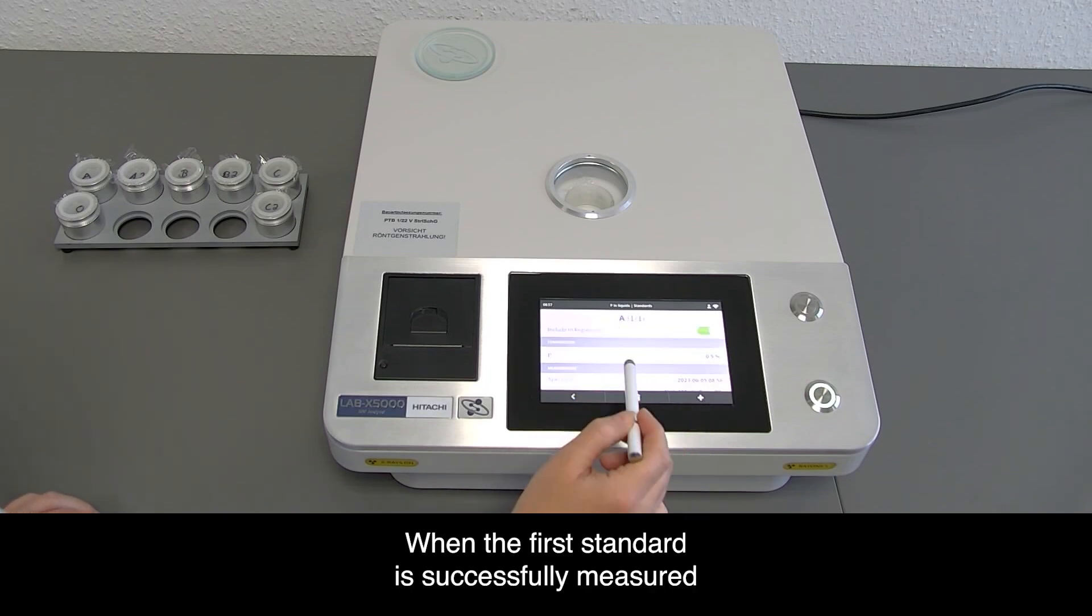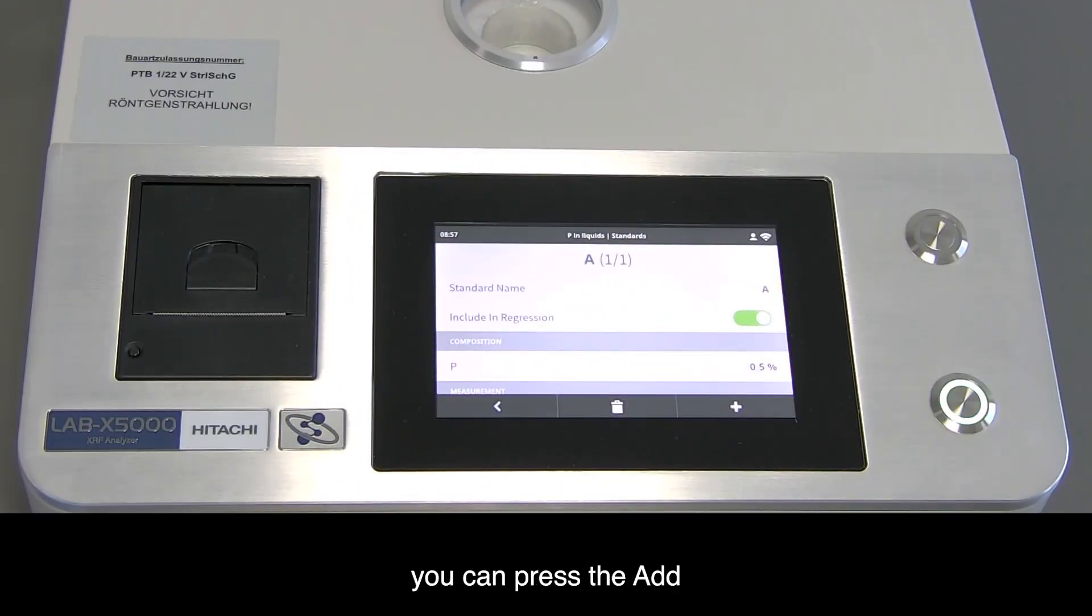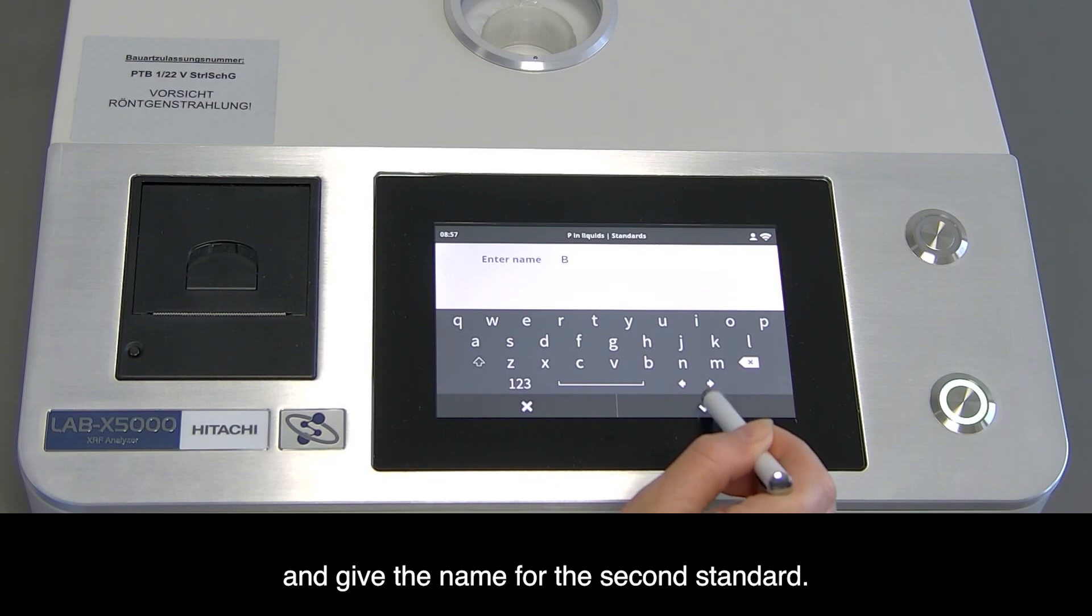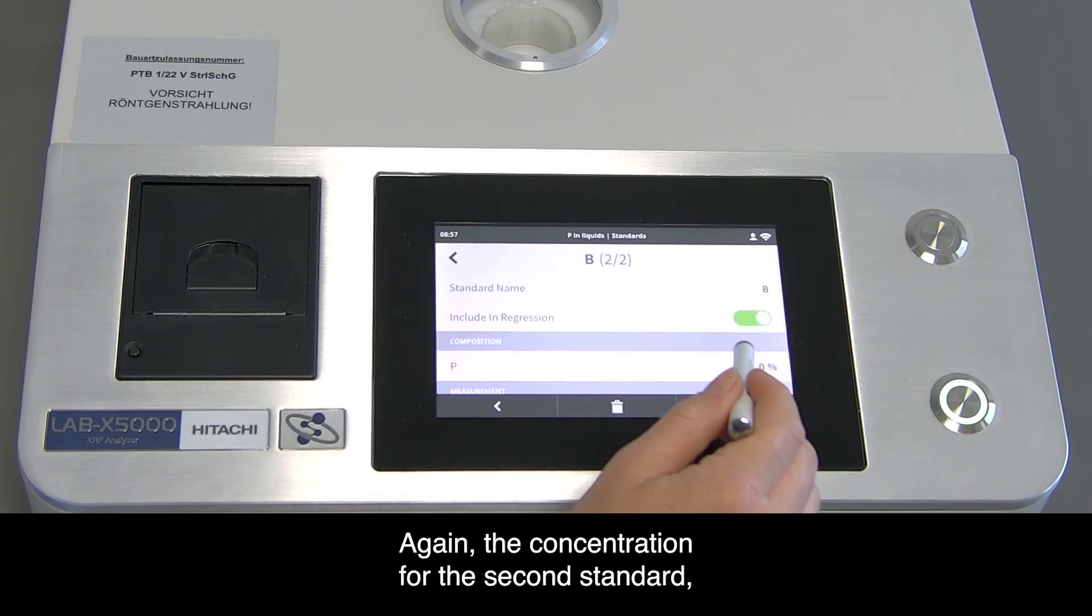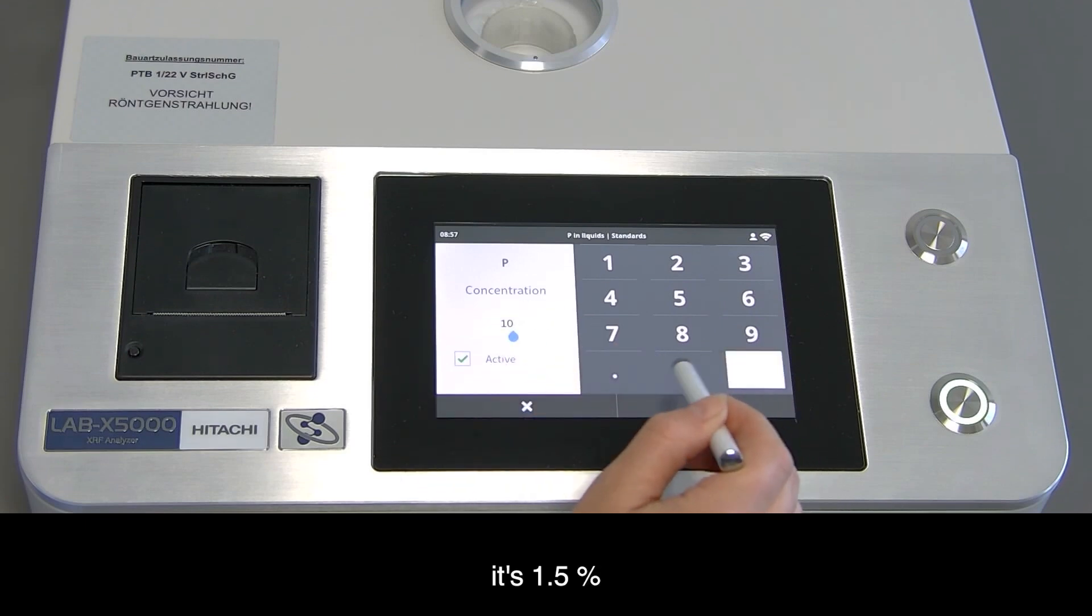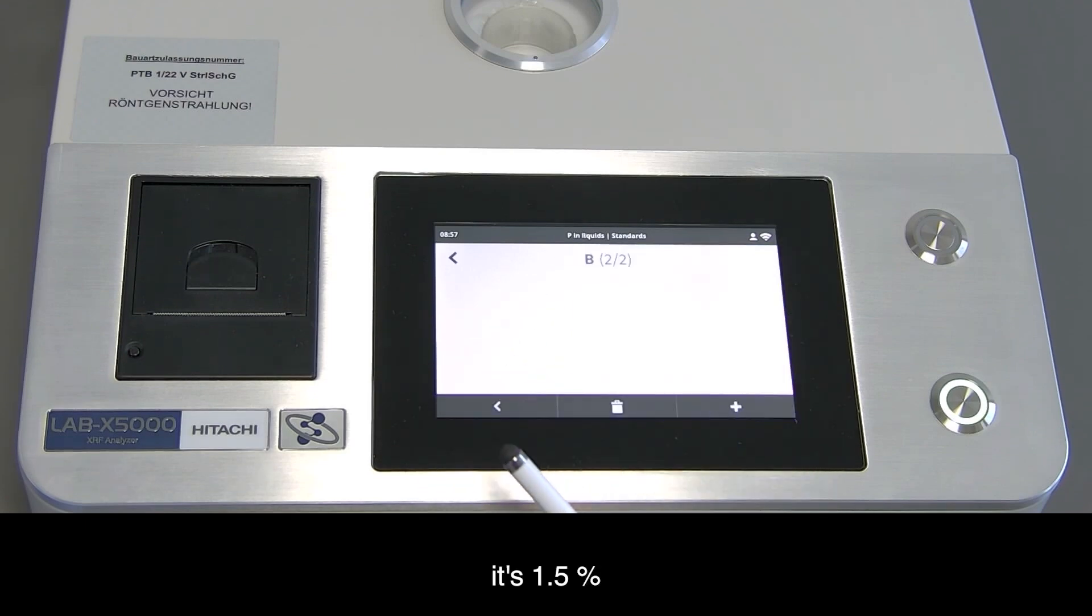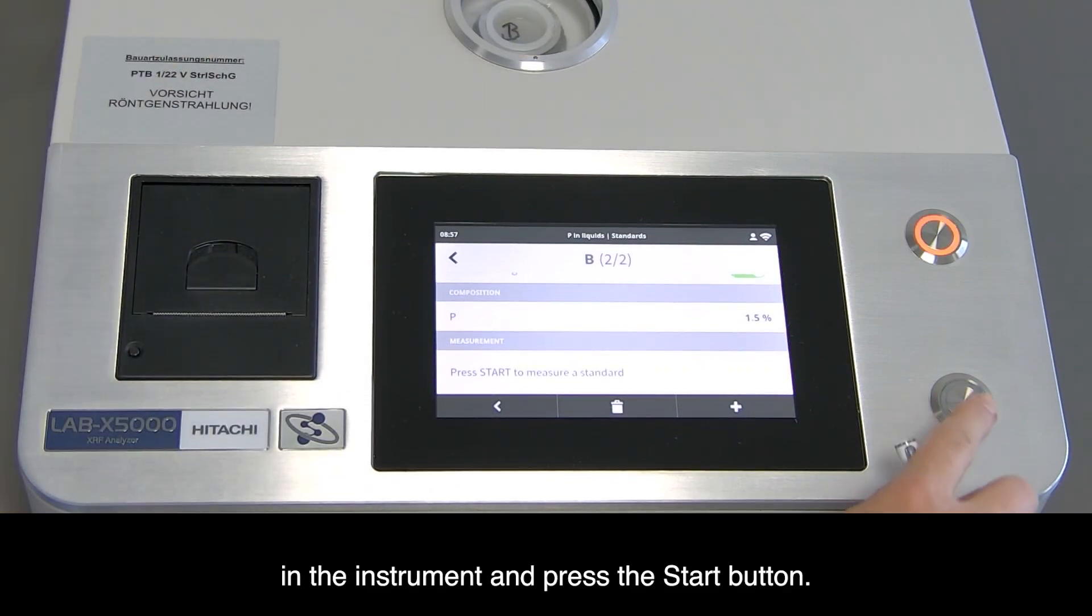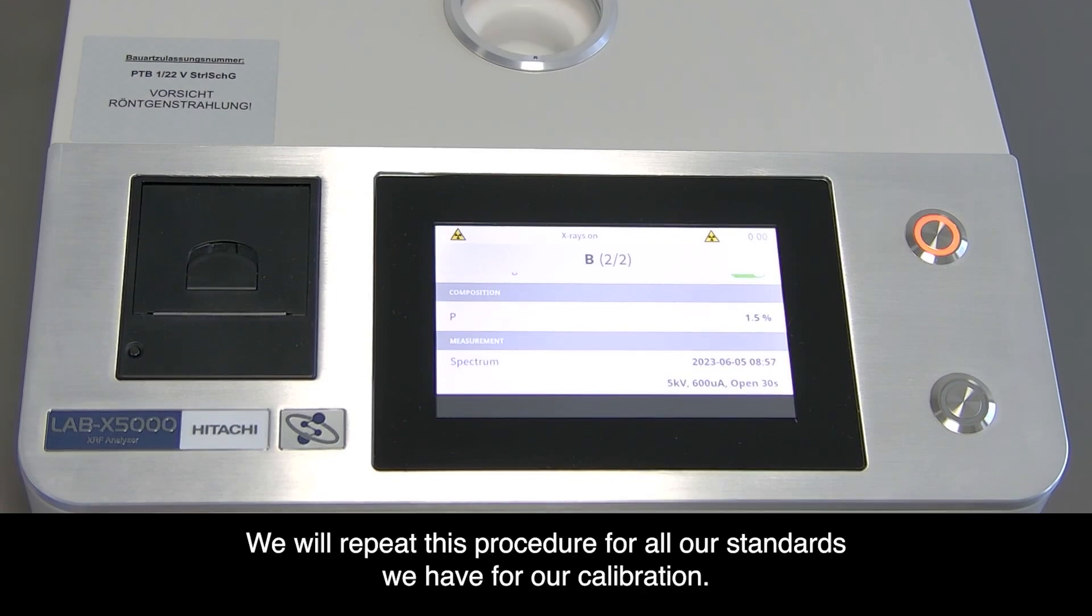When the first standard is successfully measured, press add and give the name for the second standard. The concentration is 1.5 percentage. Place the standard in the instrument and press start. We'll repeat this procedure for all our standards.